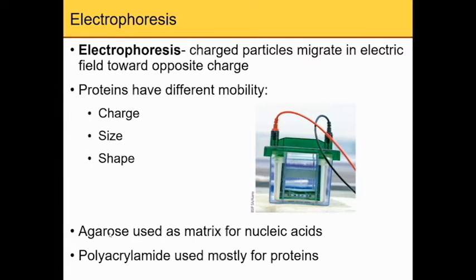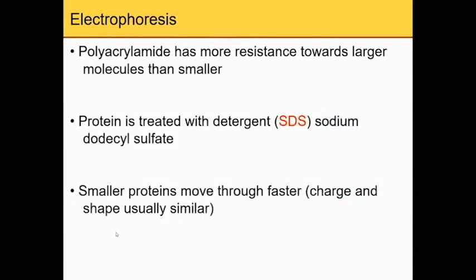All right, so it's not even. So we have to process the protein before we perform the electrophoresis, so that we can separate the protein based on their size in the electric field. That's a very important point: you need to treat the protein sample before you run the electrophoresis.